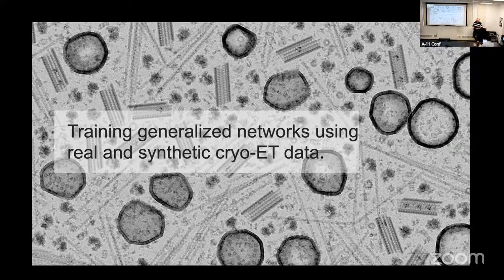Well, hello, everyone. I know we haven't all officially met, but I'm Matt Swulius. I'm here to talk today about using both synthetic and real ET data to train deep learning models, really for segmentation, because that's where we got stuck. Collecting data is not really hard for us. We've been doing it for a long time. We just pile up lots of tomograms and we don't know what to do with them.